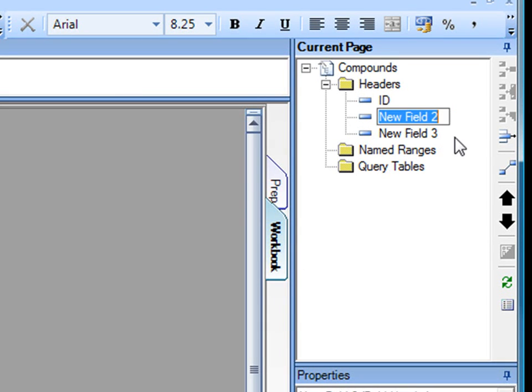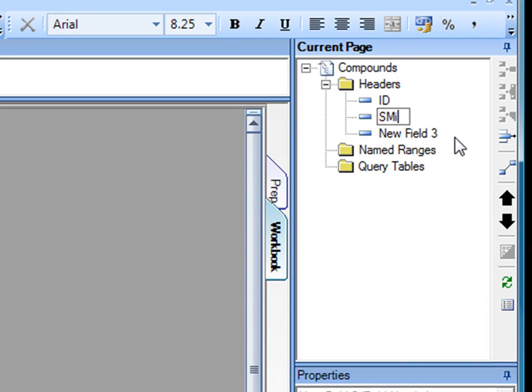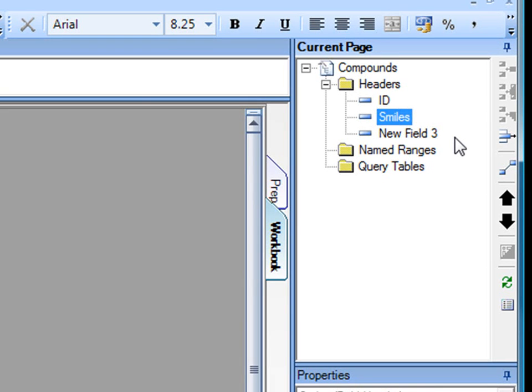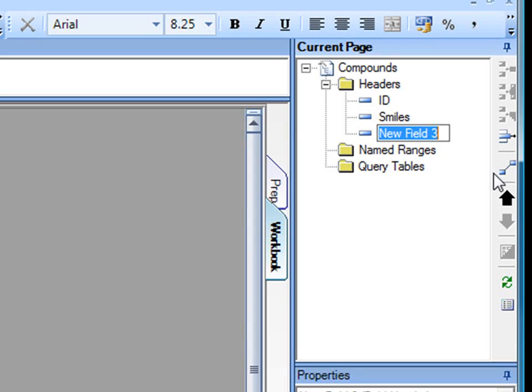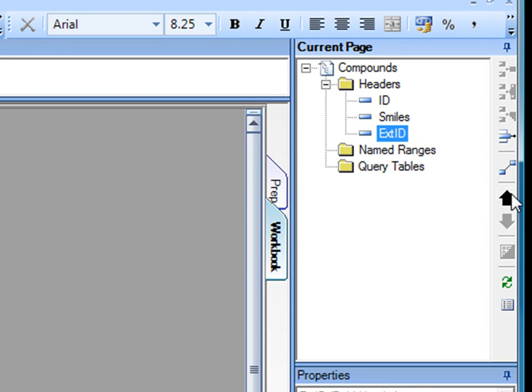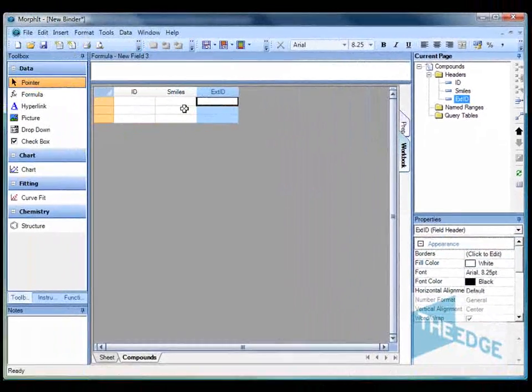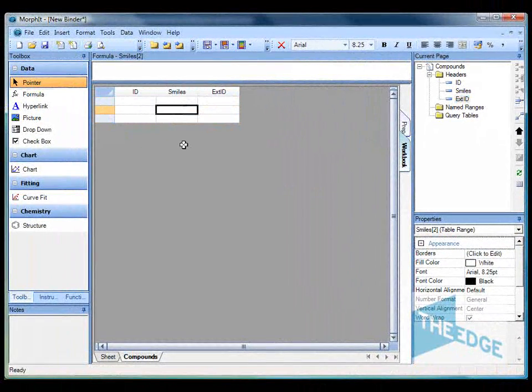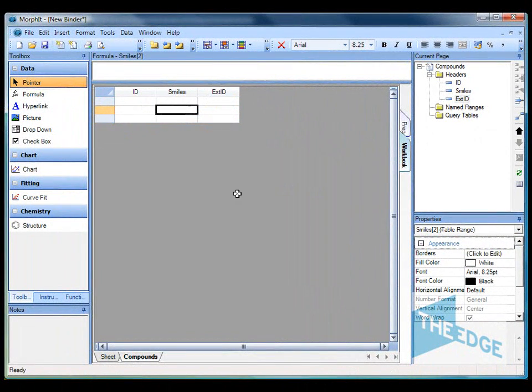The second identifier I'm going to use to store the smiles code for the structure. Smiles is a linear format for describing chemical information. The third identifier is going to be an external ID which we'll get from the source information. So here's my table with three columns.